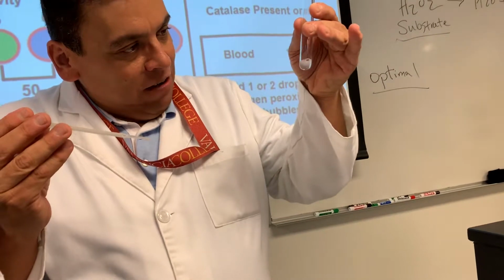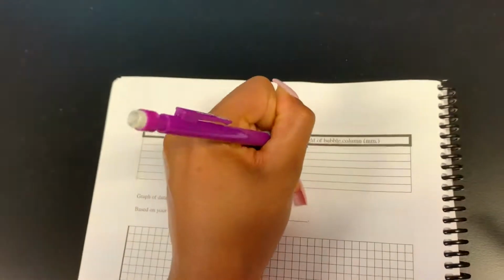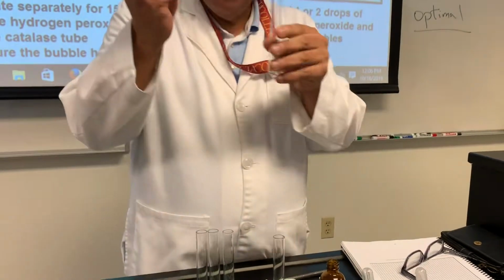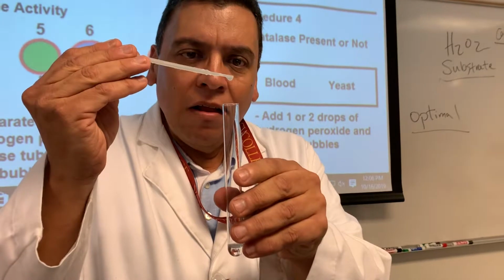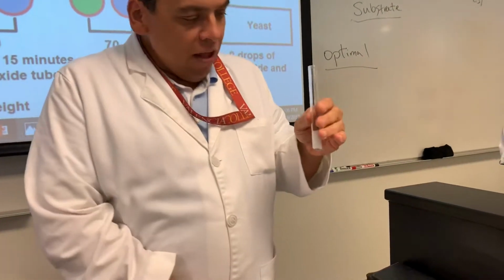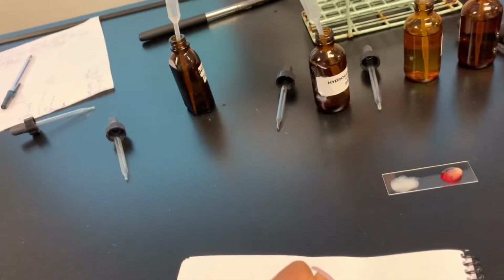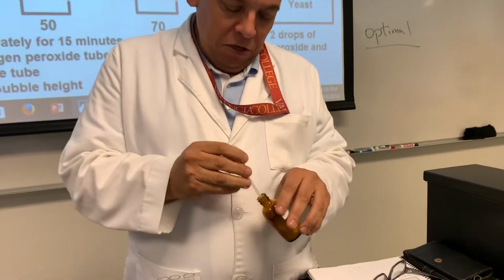All right. 0. That's cool. Nothing happened. It's supposed to be 0. Like 1 millimeter for like a split second. No. There's one. Thank you for keeping the excitement going. All right, 35. 35. My goodness. Okay, what's the next pH?